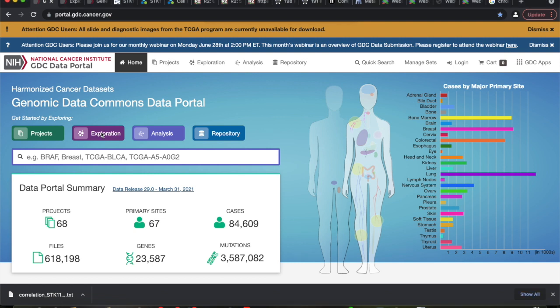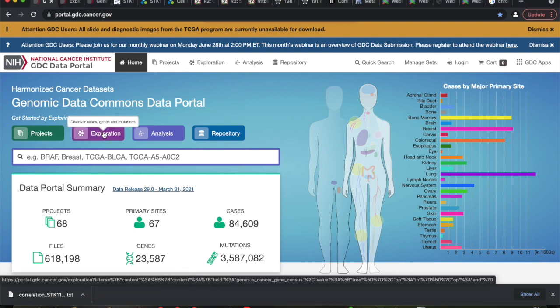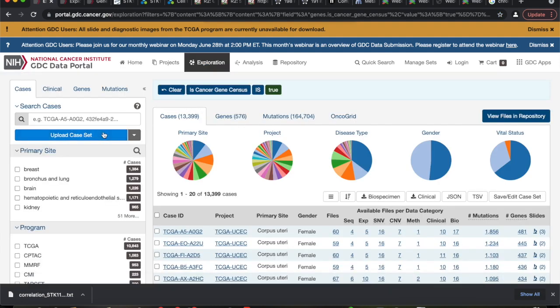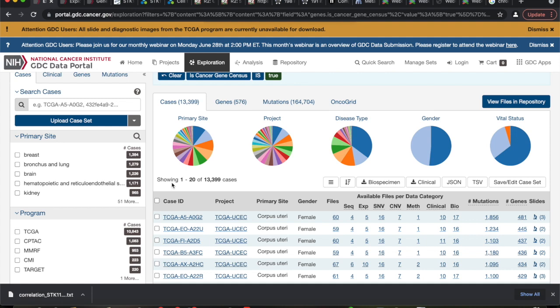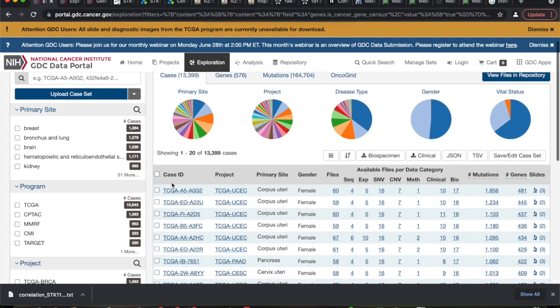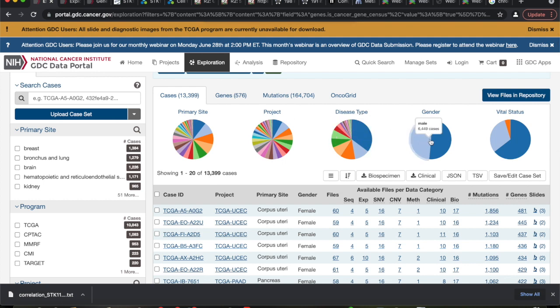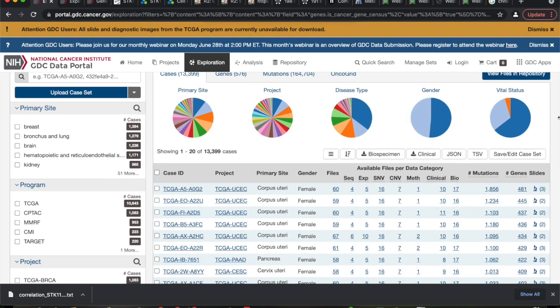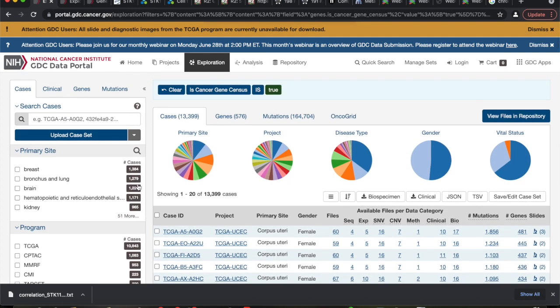On this page, go to Exploration — that purple thing — and click on that. We can see the cases: adenomas, dental carcinomas, different projects, about half male half female. We're going to filter this to be specific to lung cancer — specifically the really nasty lung cancer. Let me show you how we filter this dataset.